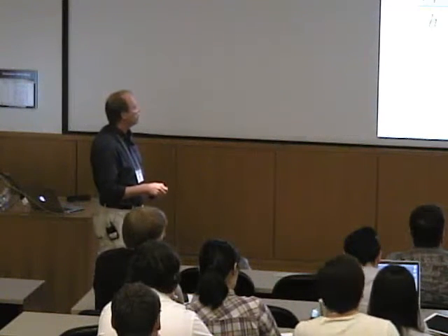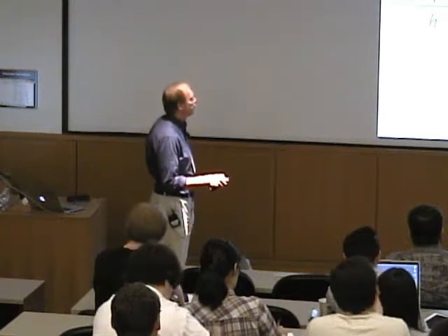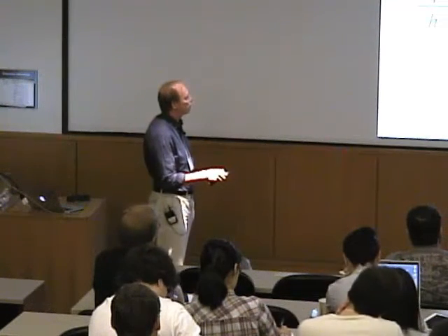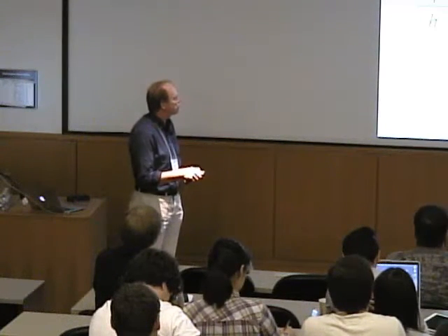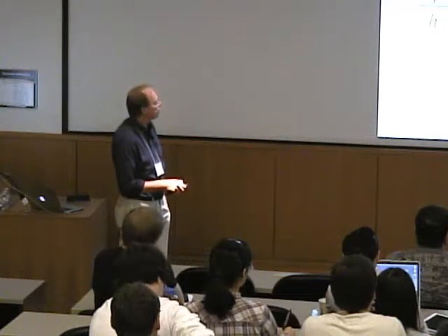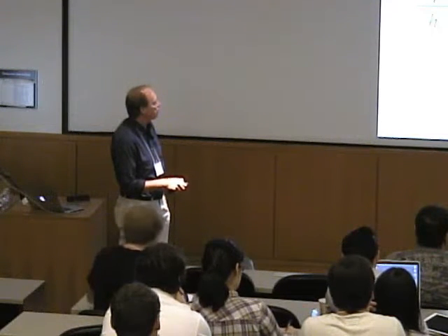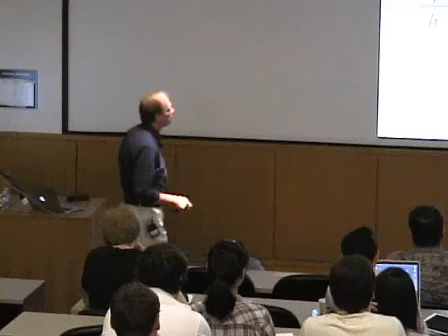And so if the electron or the magnetic moment is aligned with its z component along the field, we have the state with ms plus 1/2 and the state of minus 1/2, and there's an energy splitting which is proportional to the strength of the magnetic field, right? And so if we have radiation that matches this energy gap, then we can do transitions between these states, right? And this is what we observe in an EPR experiment.